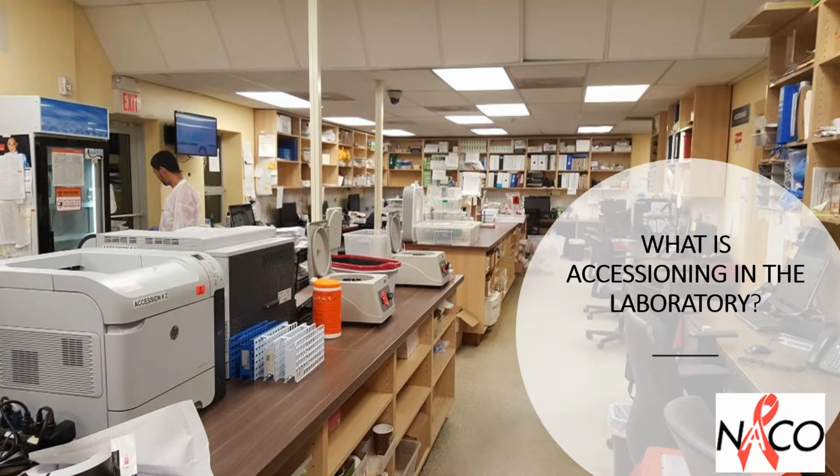What do we mean by accessioning in the laboratory? The act of logging or documenting the demographics and the receipt of specimen in the laboratory is known as accessioning. Many large laboratories have an accessioning area where samples are received, processed, logged, and assigned an identifier before being distributed for analysis.